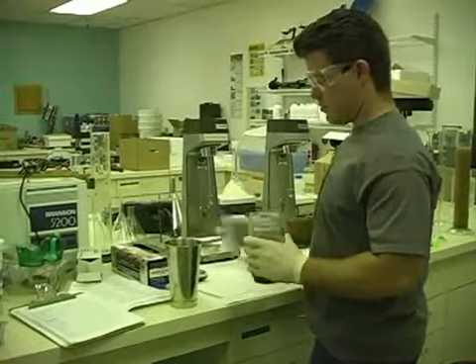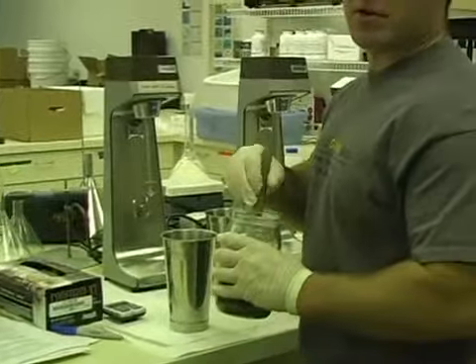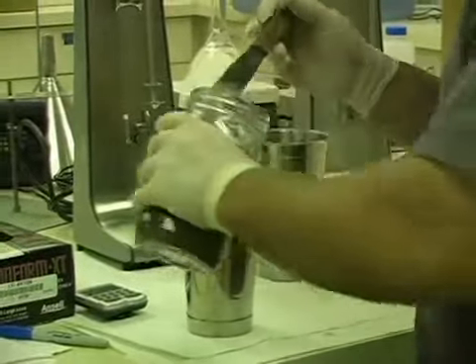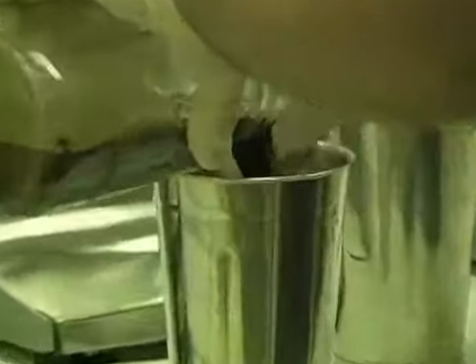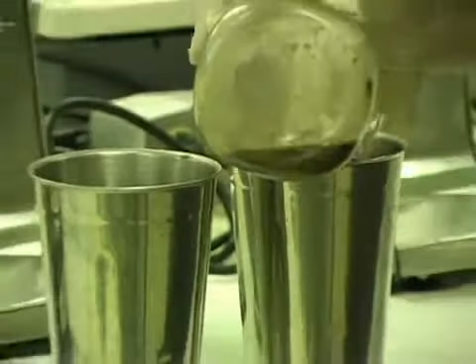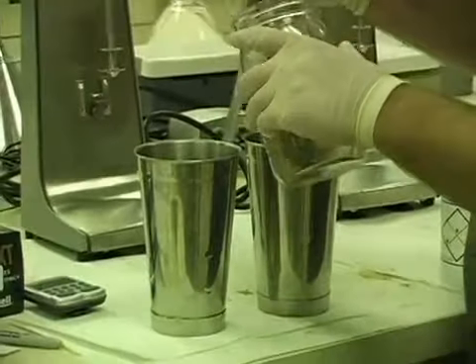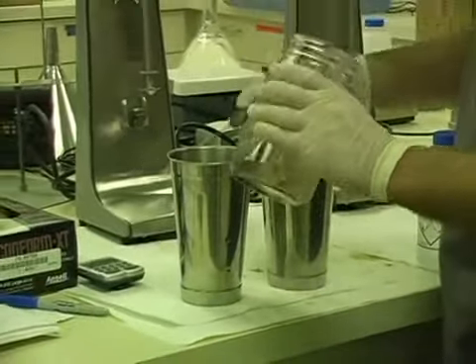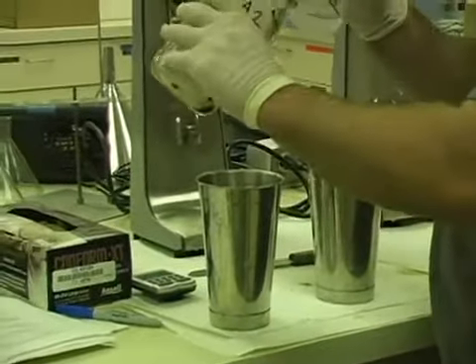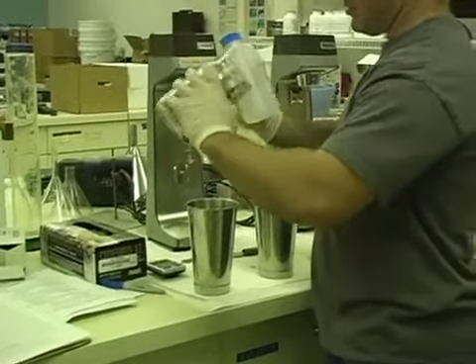Okay, we're going to take the next sample, and we're going to mix it up a little bit just to get the soil particles suspended so we can try to pour most of them out. We're going to try to split them evenly in between these two cups here, because when you put them on the mixing machines, if you have too much liquid in these cups, if they're too full, then it'll fly everywhere. So the trick is to get all the soil out of this jar using as little water as possible.